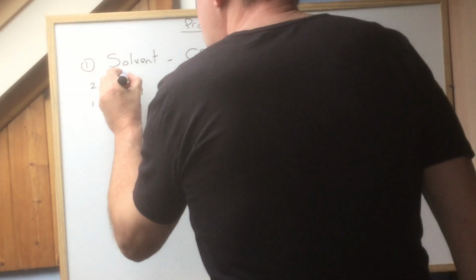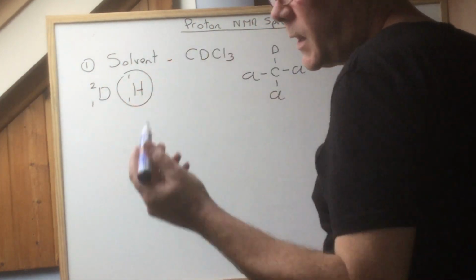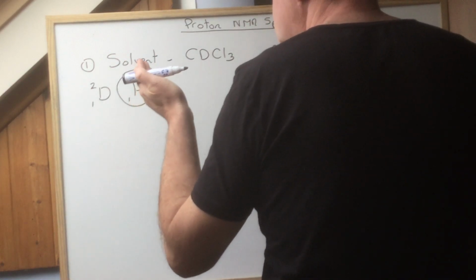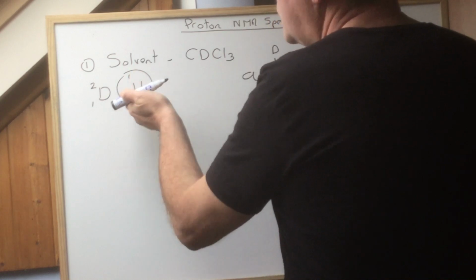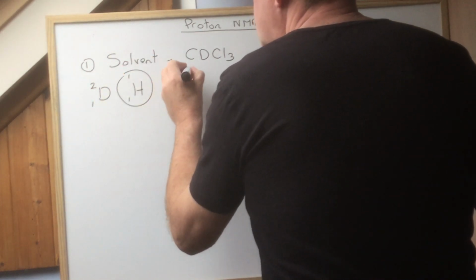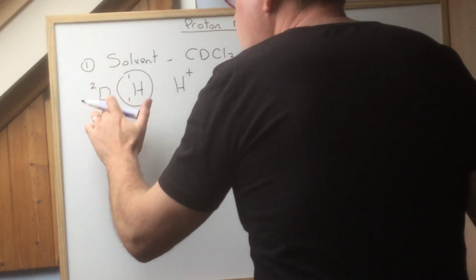Okay, either way, that will be picked up in NMR. That is what most hydrogen is. That's what NMR responds to. Proton. That's as far as we're concerned. That's what they call a proton in Proton NMR, basically, even though a proton is what you get if hydrogen loses an electron. Okay, but they call it Proton NMR. Okay, that deuterium will not be picked up.